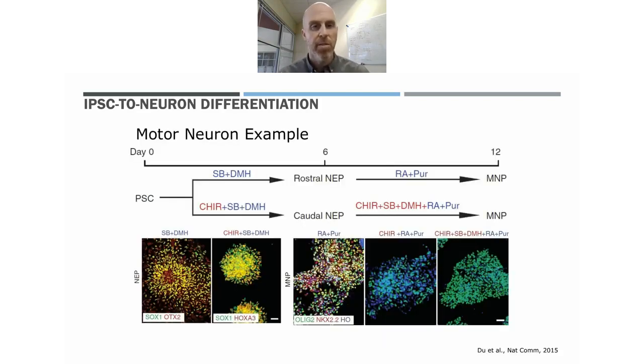So this would be an example of making motor neurons. You're going to see some more data later from Daniel about motor neurons that we may use on their system. But the idea here again is to take a patterning approach. So you're rostralizing, you're caudalizing, you're ventralizing, you're dorsalizing, and marching down that pathway that occurs during development to make an ever more restricted cell type. In this case, these would be lower motor neurons or spinal motor neurons of the spinal cord. And these kinds of approaches, using different factors and different timing, can be used to make a range of neurons and glia.